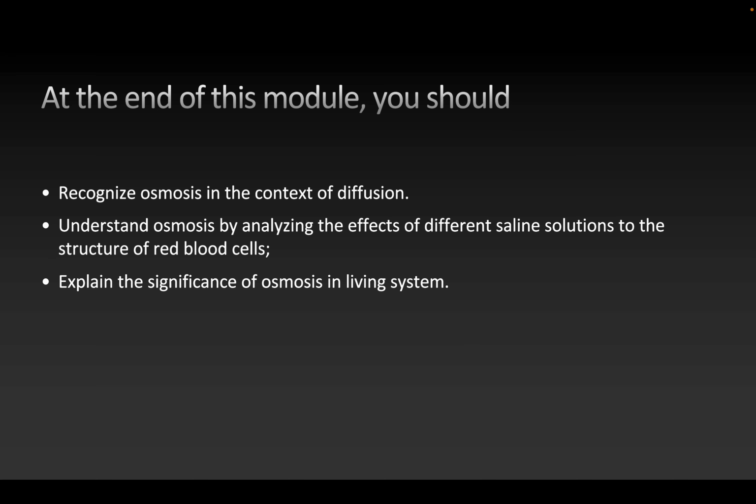Number one, you must be able to recognize or understand osmosis in the context of diffusion of molecules through a semi-permeable membrane. Second, you must be able to understand osmosis by analyzing the effects of different saline solutions to the structure of red blood cells.